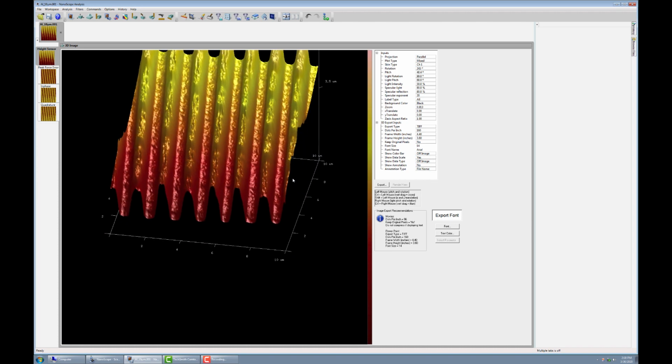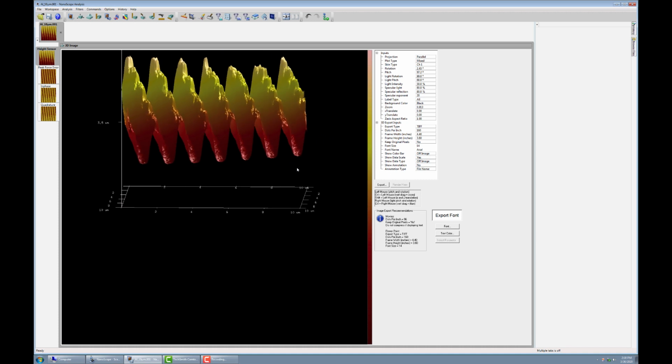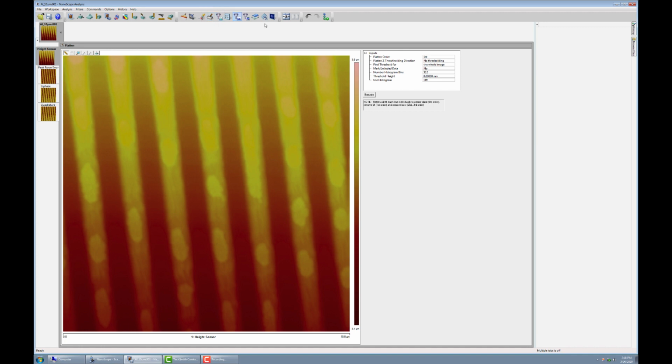And so you'll also notice that our sample was a little bit tilted as we were getting this data, so we can flatten it to make it more flat on that Z-axis using a flatten tool up here. It looks kind of like a roller brush. As for the order, if the Z-axis was really high, flattening it to the 0th order would bring it down.